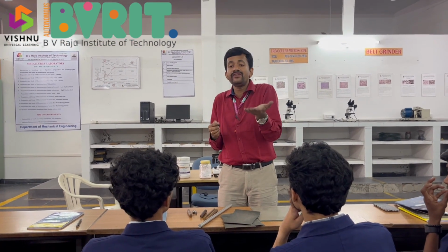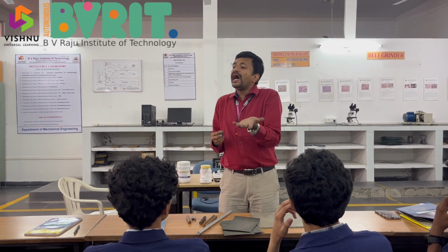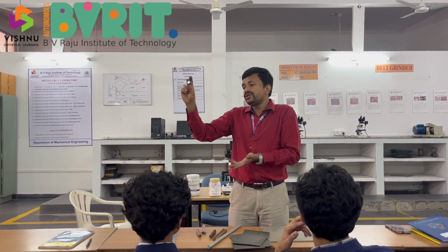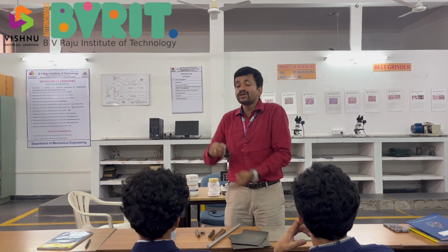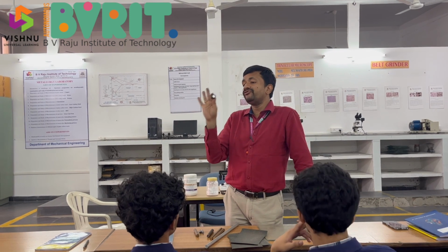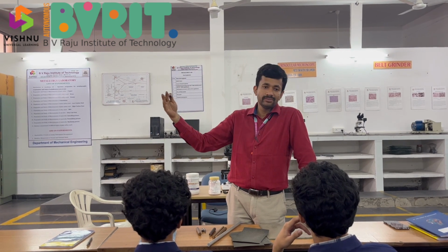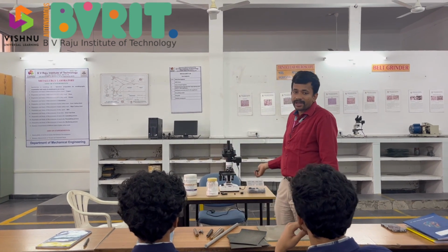There is a velvet cloth attached on top of the disc, and we apply this alumina powder mixed with water, and you take this specimen and apply a little amount of force on top of it. As a result, you will now see a mirror finish. You can just imagine, like, this is a mirror, small amount, reflection will be so good. So that is the mirror finish that we are going to get. Okay. Now when you observe under the microscope, what will you see?